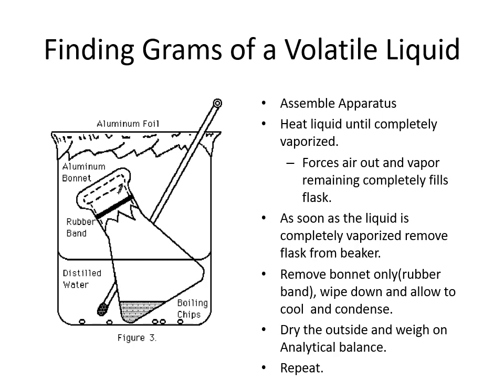Once we remove the Erlenmeyer flask from the beaker, once it's cool enough, we take that rubber band off, take the outside piece of aluminum foil, and we're going to leave the smallest piece of aluminum foil with the wire in order to make sure that we're not allowing any of the gas that completely fills the container to escape.